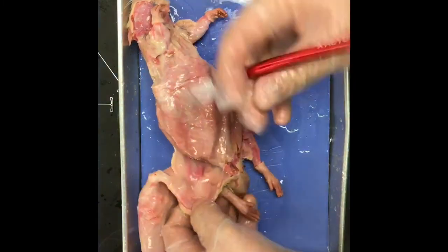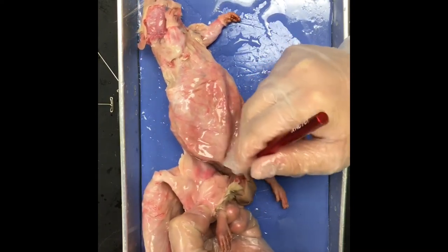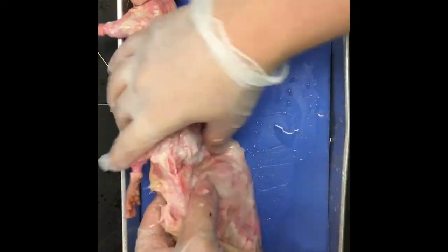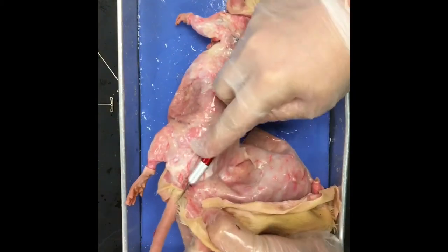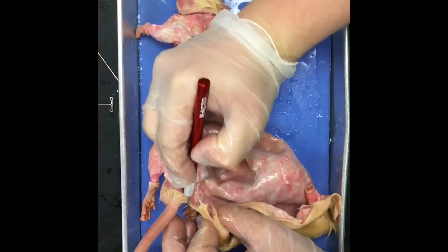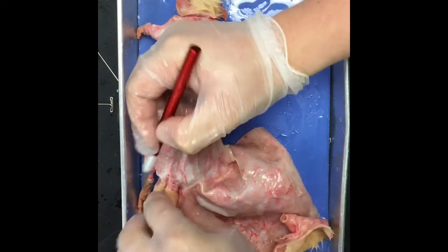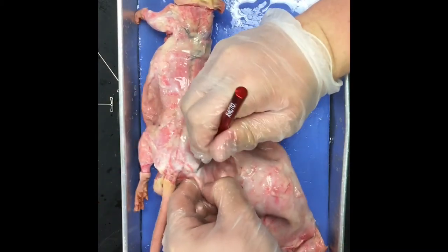All right, so with this one, you cut some of that connective tissue away. Push the leg up a little bit. Get in there. There'll be a lot of blood. Oh, yeah. Boop. Lots. This part's very slippery, fair warning. With this part, you may have to come through and cut away the skin.